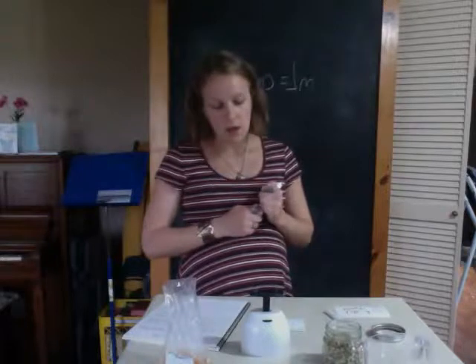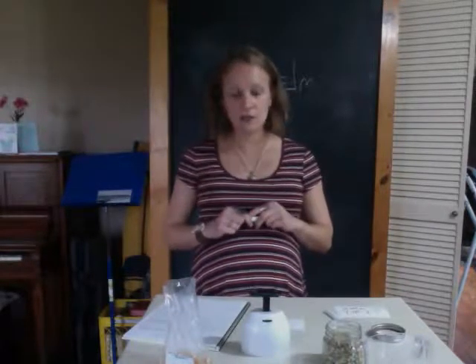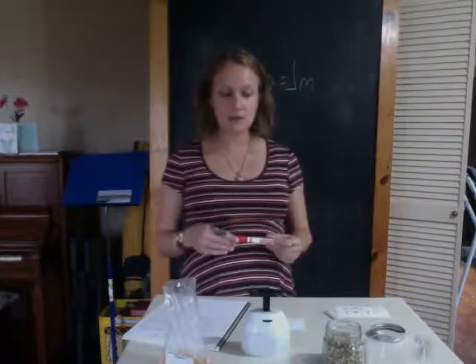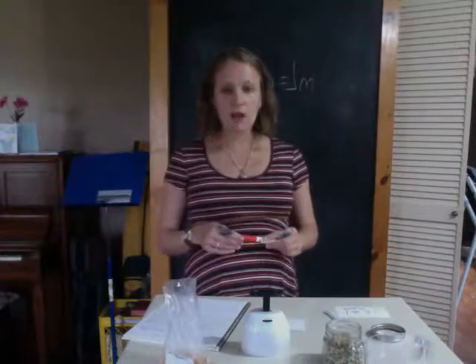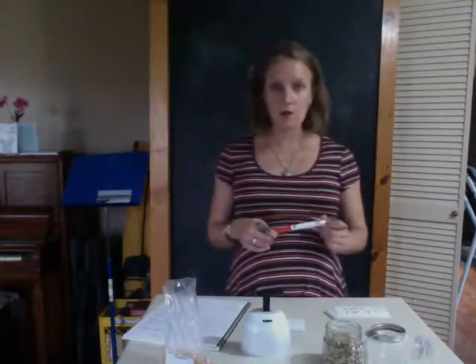So I will be posting a second video showing the calculations, and in the meantime you can gather your materials, maybe get your data, the masses of each of your samples in replicates of 5 as assigned in the lab manual, and then when you're ready to do your calculations you can click on the calculation video and follow along or read the directions in your manual. Good luck!